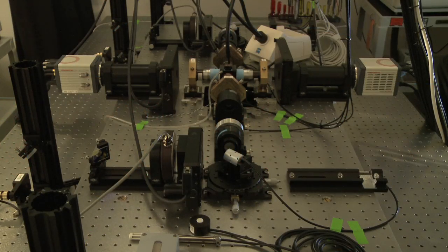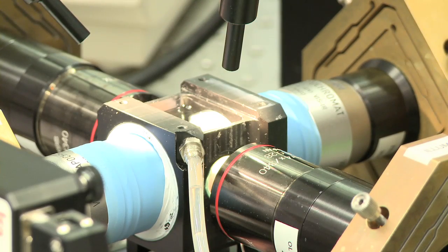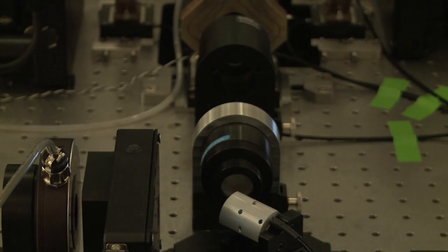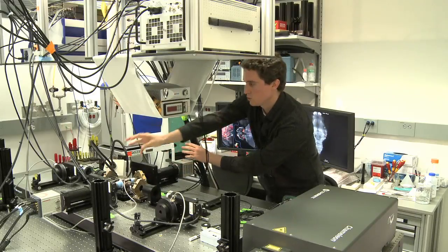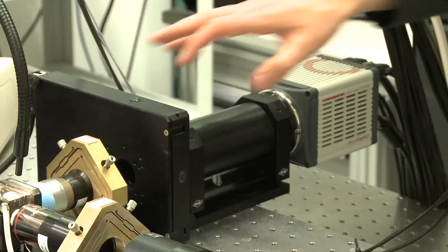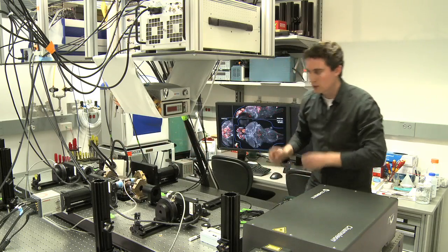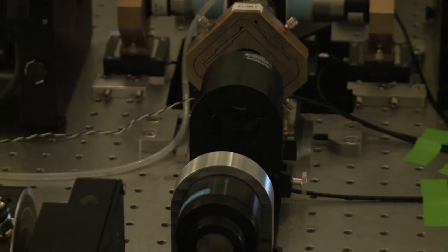Now, the way this microscope works is that we send thin sheets of laser light into the sample chamber, and the zebrafish would be located inside this chamber here in the center. The sheets of light that we create here in these two illumination arms enter the chamber and illuminate the sample in a thin section, and then we image that part of the brain, record it with two detection arms here at a right angle to these illumination arms. You can see these fastest CMOS cameras at the end of each of these arms, one here, one on the other side.